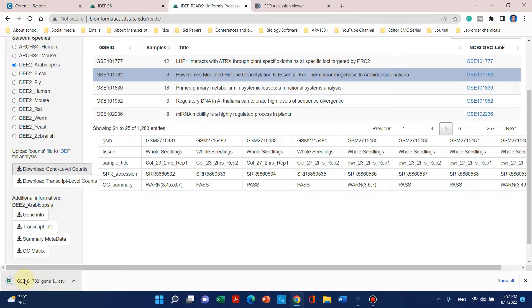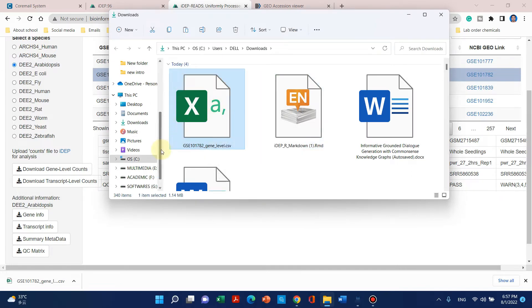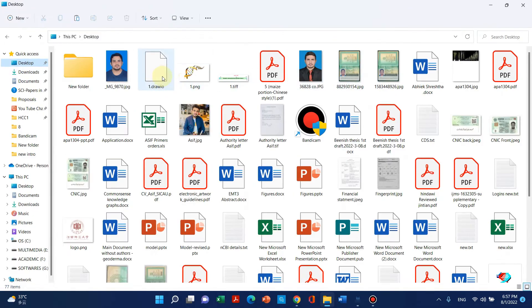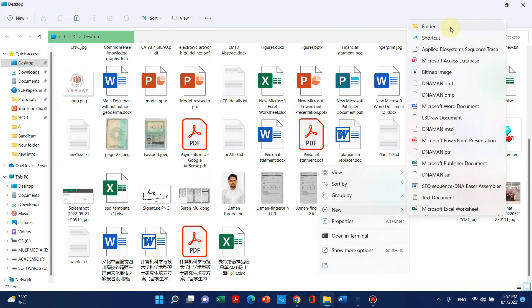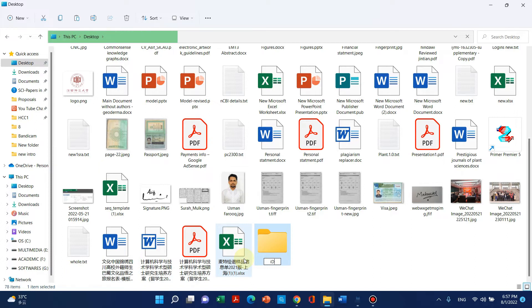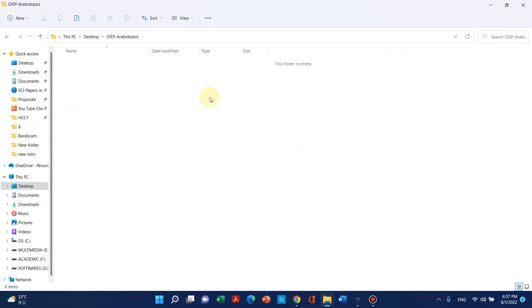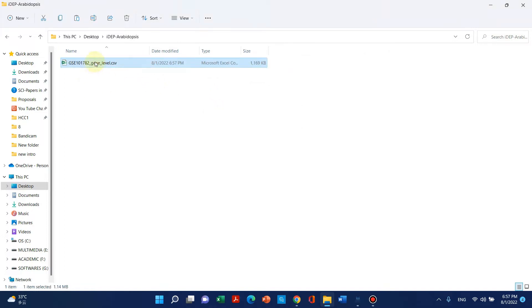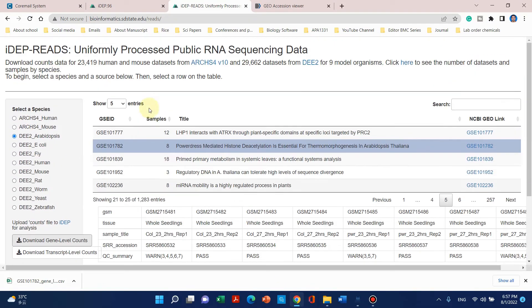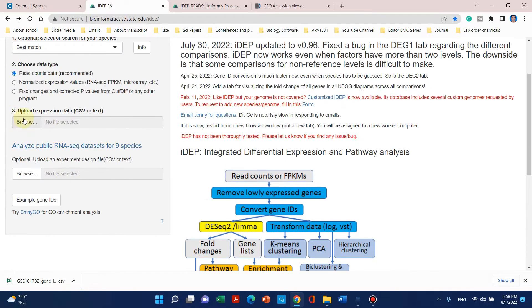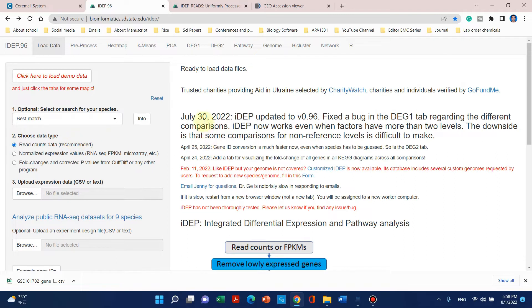The gene file has been downloaded. Let's move this file to a desktop folder so we can easily track where we are working. We can create a folder on the desktop. Now we can paste that file there. Since we want to upload this file to the IDEP website, we go back to IDEP where we can upload our expression data and download the experimental design file.